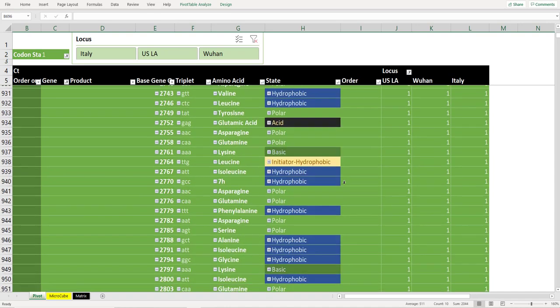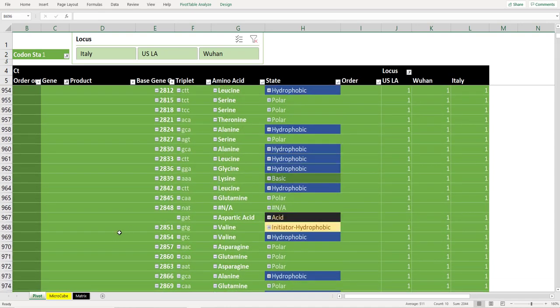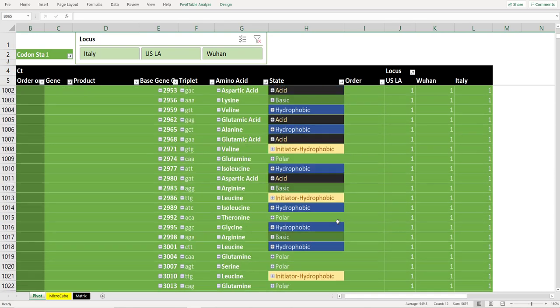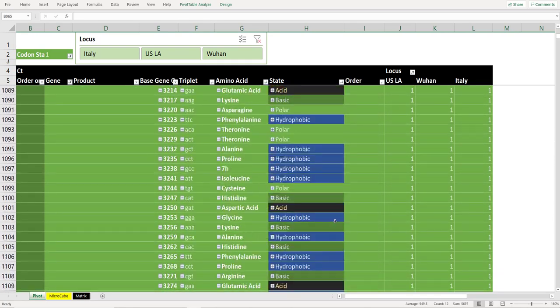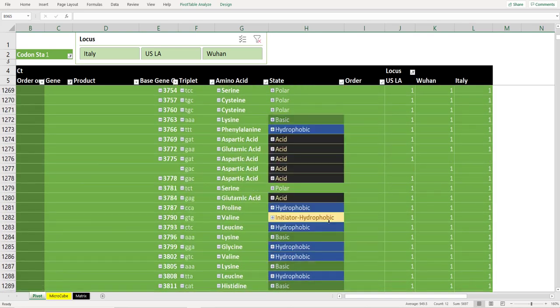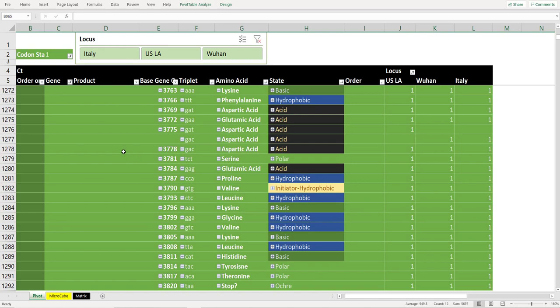And what else we got? Anything else? Something here. That looks like a nucleotide sequence missed, so I wouldn't worry about that. Whenever we see that N, don't worry about it. It just means unidentified. And toward the end, we've got a little aspartic acid change, but not much.